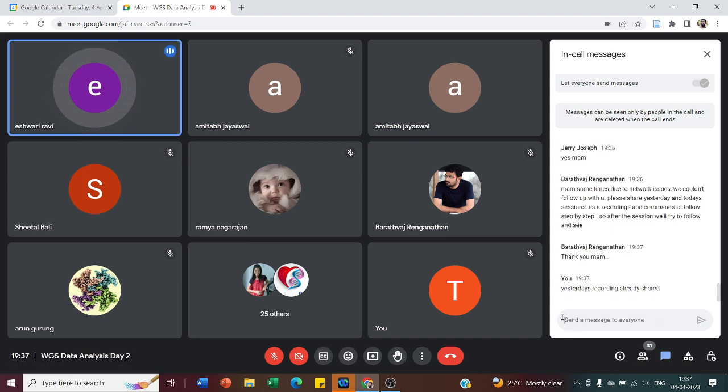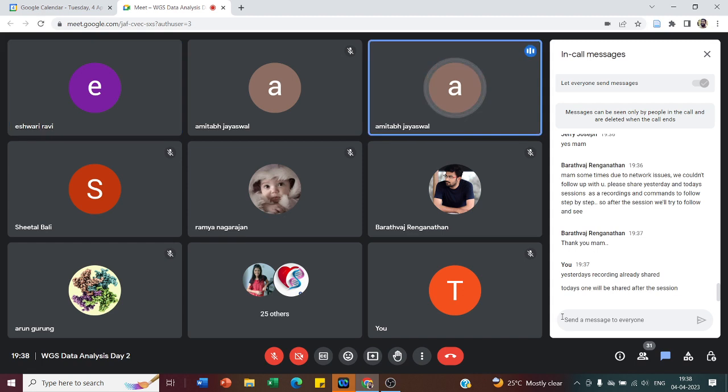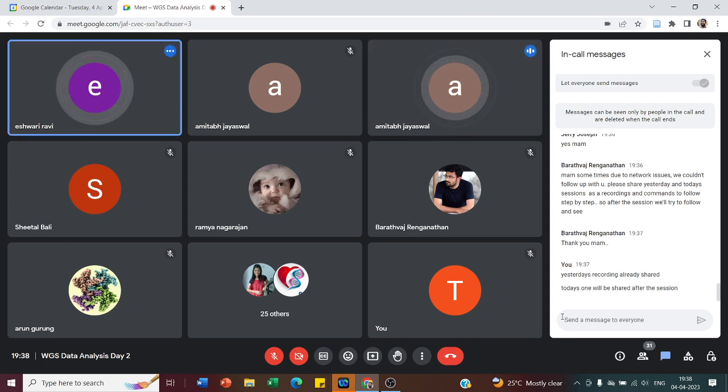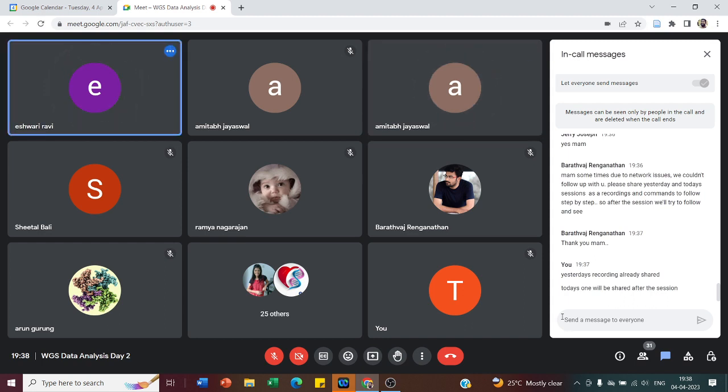These two are very lengthy processes and take a very long time to perform. So for tomorrow's session, if you want to get the variant result file, I would suggest we perform the alignment tonight itself. I will give the command, you can just follow the command as it is. If I'm able to follow whatever is to be followed today, then I should be able to do this alignment. Yes, yes.